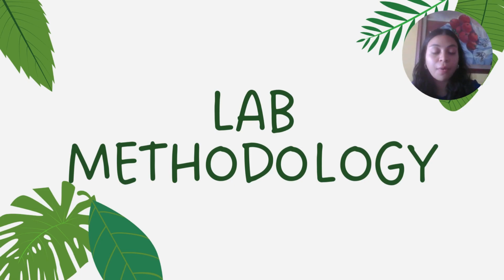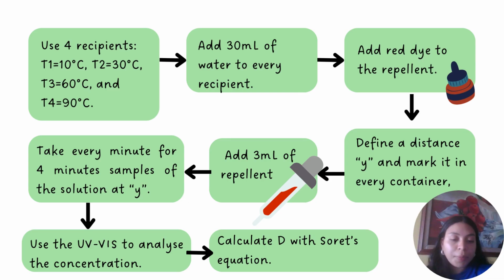Now we will show the methodology that was used in the lab. In the lab, we started with 4 containers, each of them marked with a different temperature, which were 10, 30, 60, and 90 Celsius. Then to each container, 30 milliliters of water at the respective temperature were added.